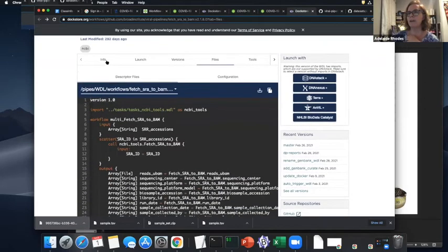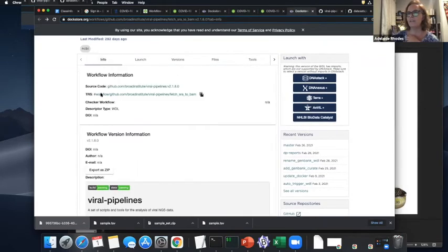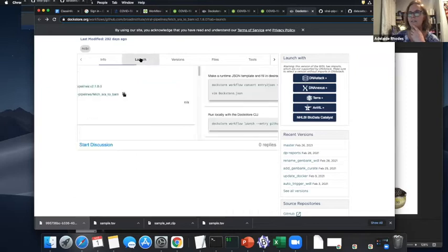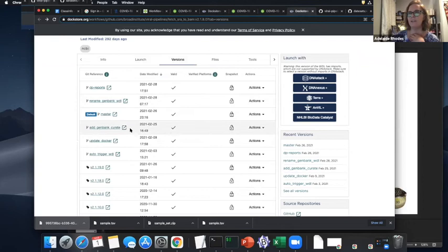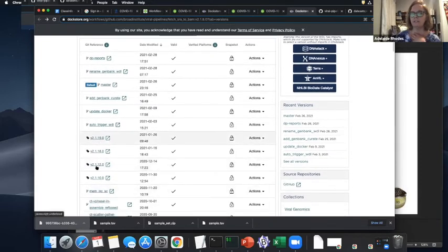So like I said, there's versions. So there's info here. This gives me the version. There's how you can use it if you want to run it directly, you don't need Terra to run it. This gives you what's been happening in the past, like what's changed between versions, right? And so you can see this has recently been updated. It's been modified just yesterday, right?